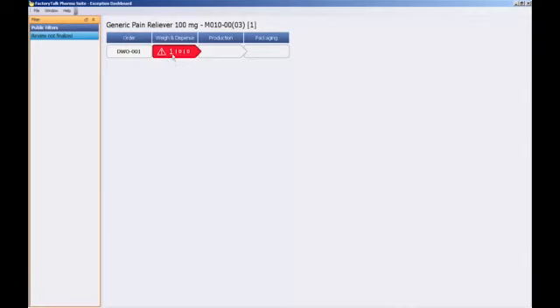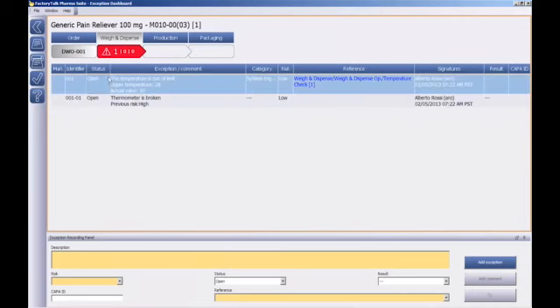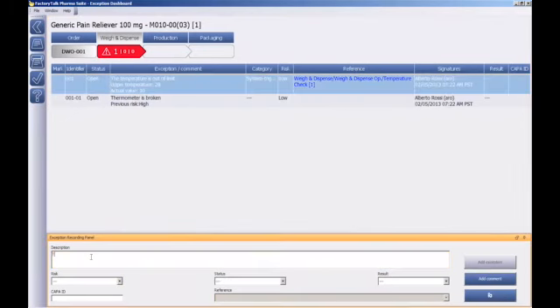It is also possible to return to the Quality Assurance Office to get a quick look at the exception dashboard. It displays the weigh and dispense order step that we are executing, which is also turned red. The number 1, now displayed on the left-hand side, means that an exception was recorded and needs to be handled. Selecting this will show more details regarding this exception and allows quality personnel to add their comments. Temperature should be rechecked.